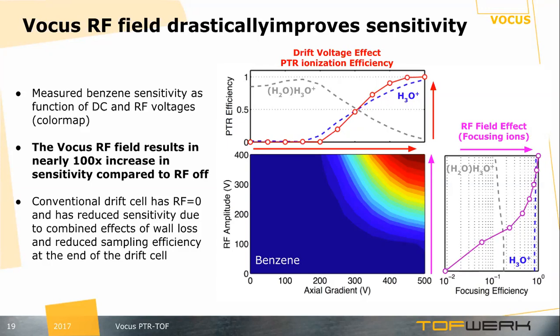So formaldehyde is a very tricky one that we haven't looked at super carefully in detail. We've been working mostly with the benzene, toluene, xylene mixture, and then biogenic hydrocarbons and things like that. So compounds like formaldehyde will be very tricky still, but have not been investigated in detail yet.